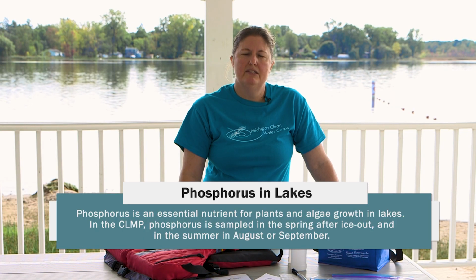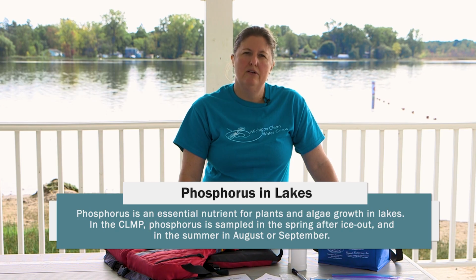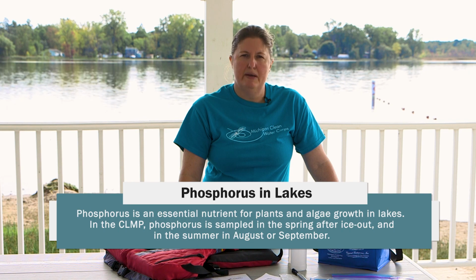In the Cooperative Lakes Monitoring Program, phosphorus is sampled in the spring, after ice out, and in the summer in August or September. Before heading out on your lake, please assemble the necessary equipment.